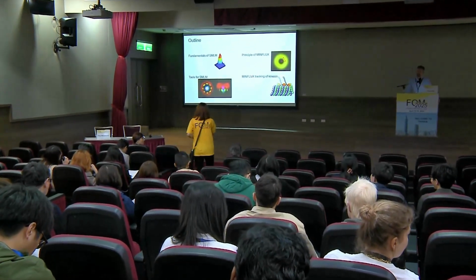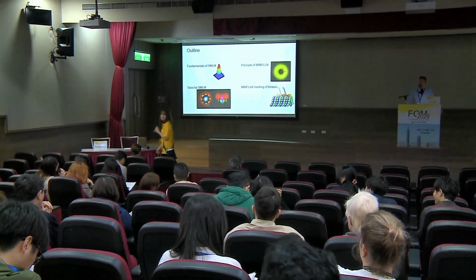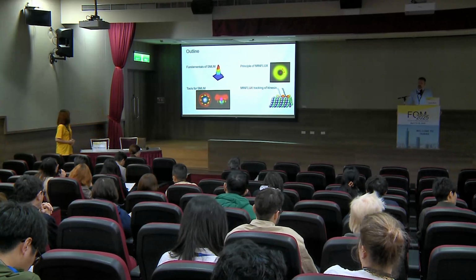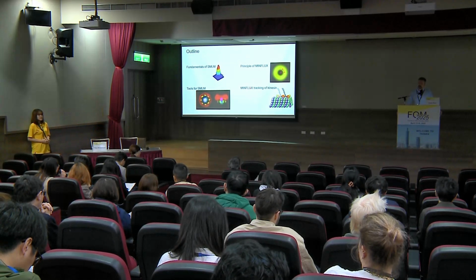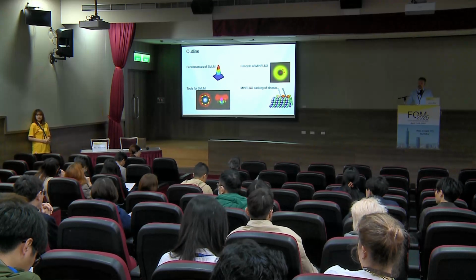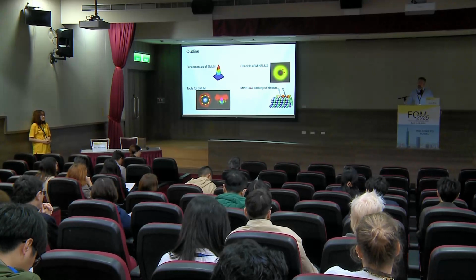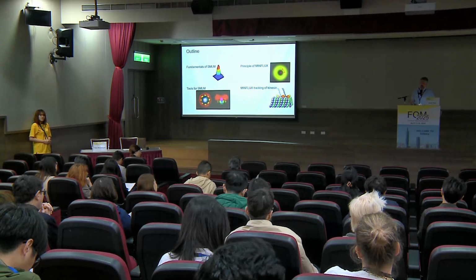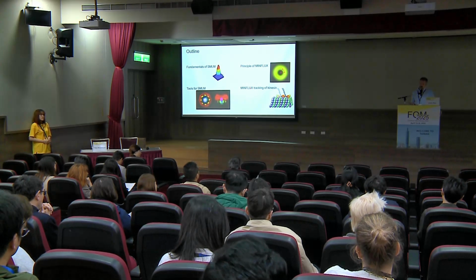Sorry, maybe I have a question for the more previous slides. You showed us the 3D image with astigmatism, also with biplane. I'm curious, how's the performance of biplane versus astigmatism? So I think there have been studies on this which showed that biplane might be a bit better. We in my group use mostly astigmatism for 3D because it's simpler.